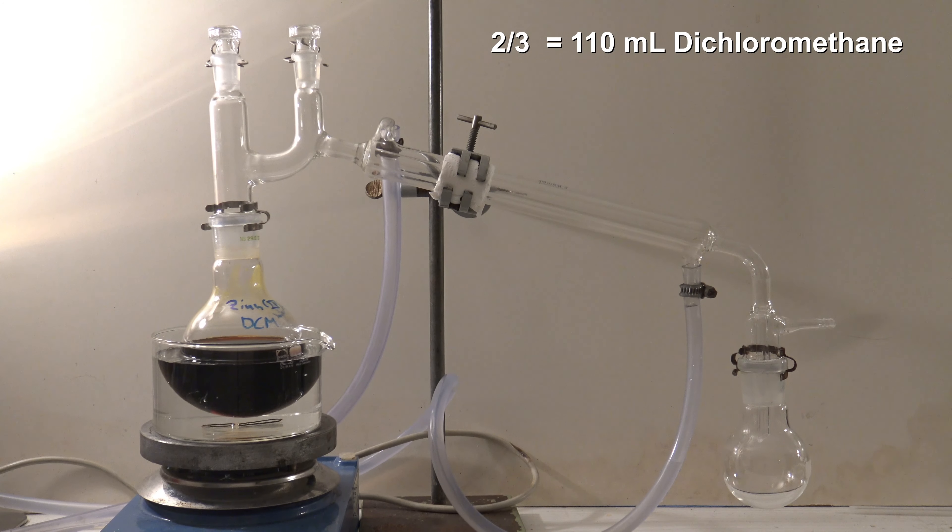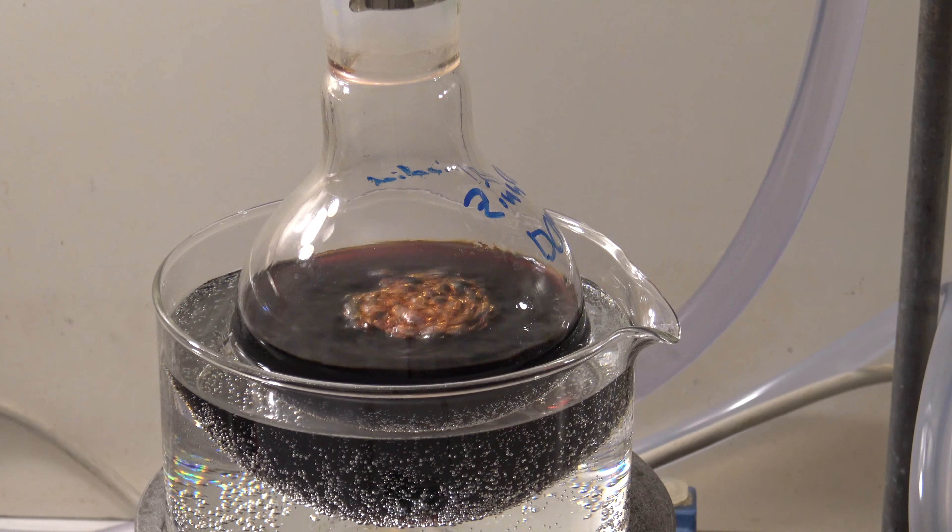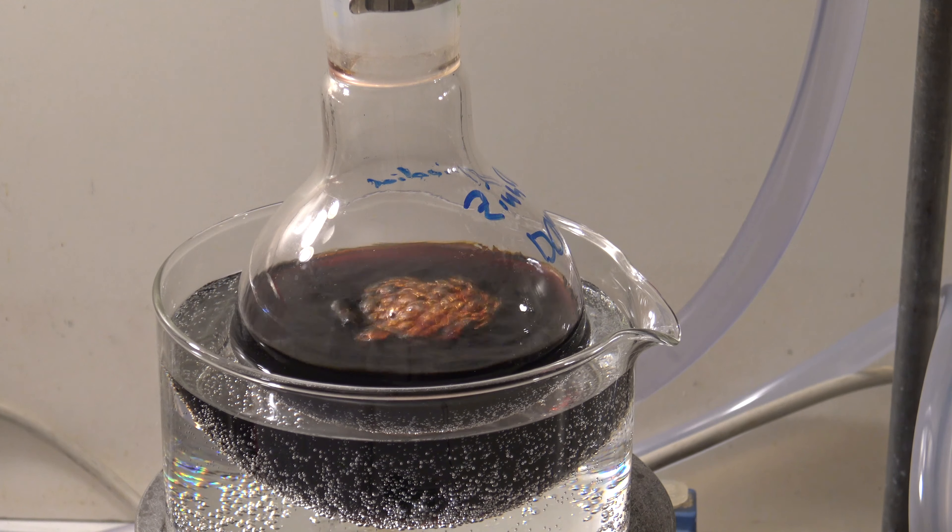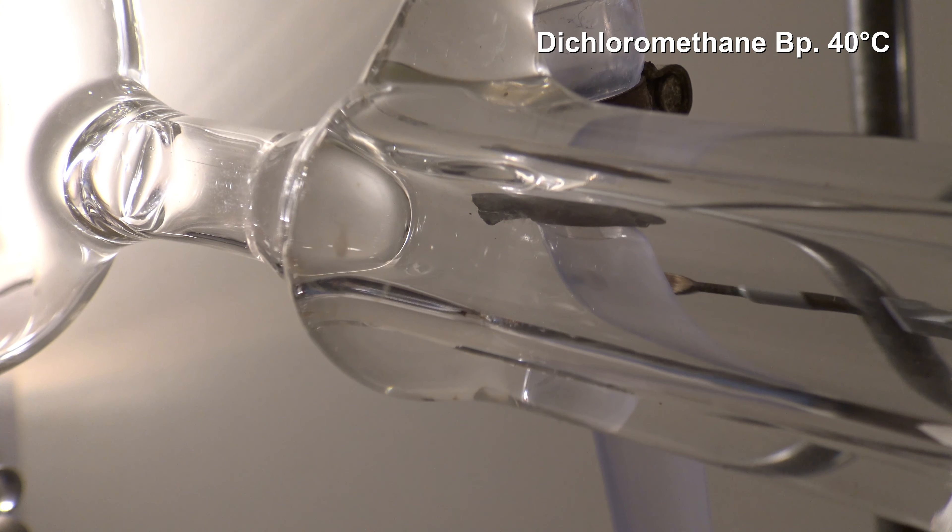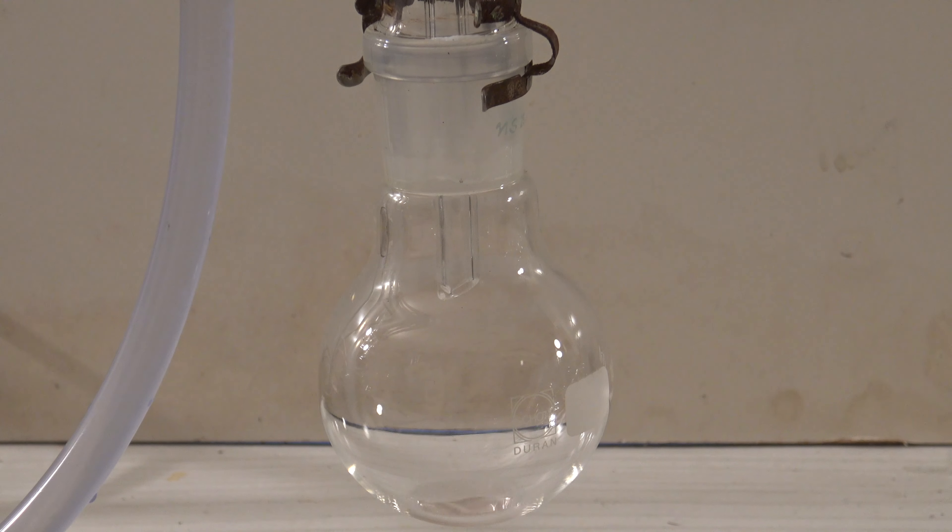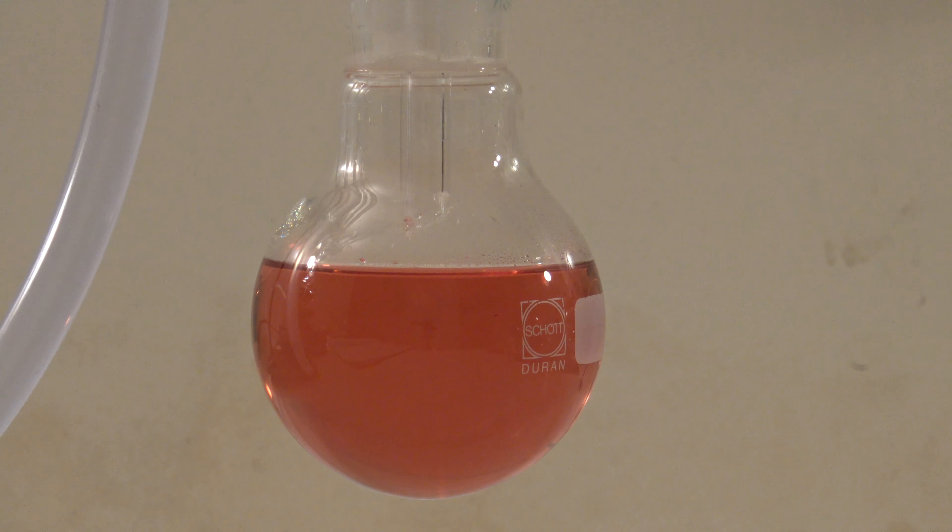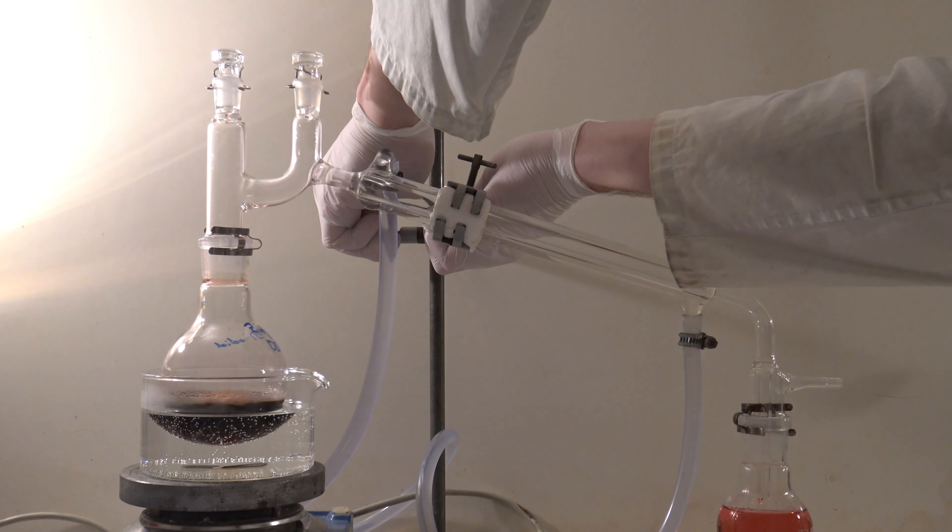Unfortunately, a 100 milliliter round bottom flask was the only one available. Dichloromethane has its boiling point at 40°C, so a water bath is sufficient for heating. In the distillation it could be seen that the separated solvent contained iodine, which meant that residual iodine was still present.